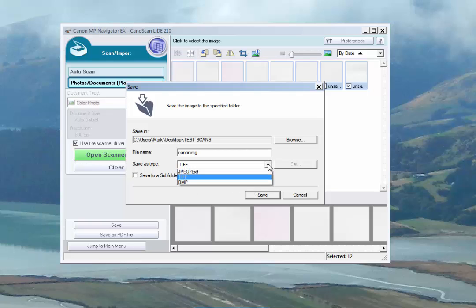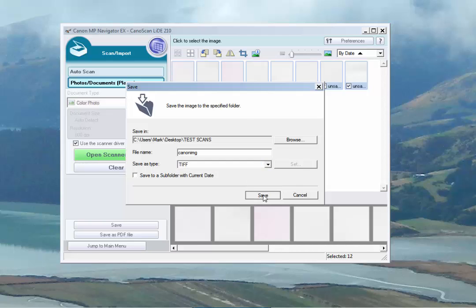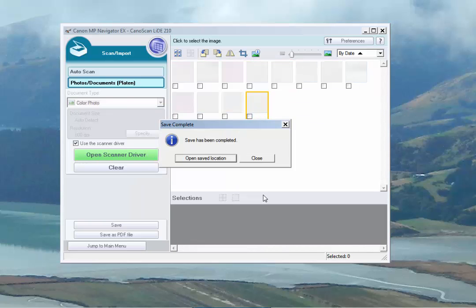We've got save as type. We've got JPEG, TIFF, and BMP. Of course, we never want to use JPEG. It's a lossy format, so we lose data with that. TIFF and BMP are both uncompressed. And ImageJ prefers TIFF, so we'll stick with TIFF. And here we go. And we'll hit save.